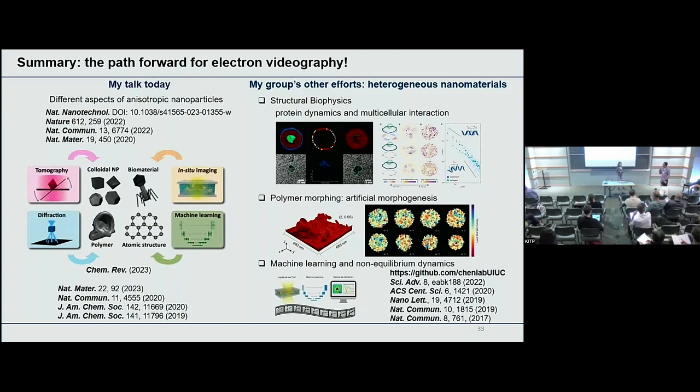Yeah, we haven't done that. Right now for that experiment, we're using spherical particles. That's why we're thinking in the future we can either use anisotropically shaped particles like rods, or we can also use patchy nanoparticles. For example, if we just have one patch on one end, that would introduce a different symmetry. That could be interesting. Another thing we haven't tried is that, when it comes to electric field self-assembly, there's a huge parameter space in terms of the frequency and also the field strength. We didn't try that thoroughly yet. So I feel that's the starting point of a lot of possible experiments in the future, right?